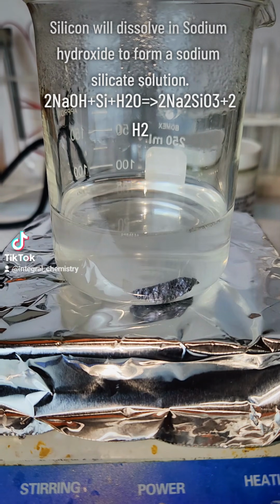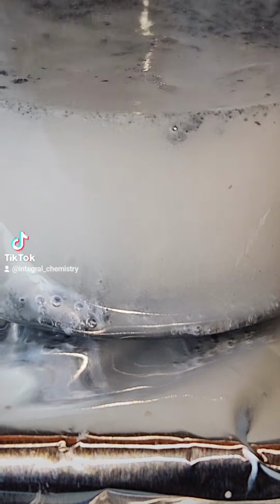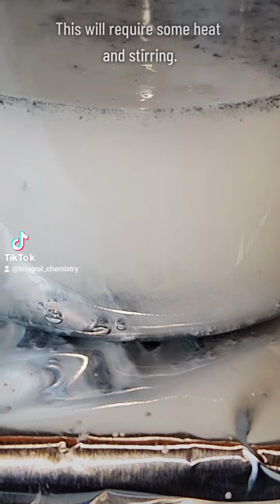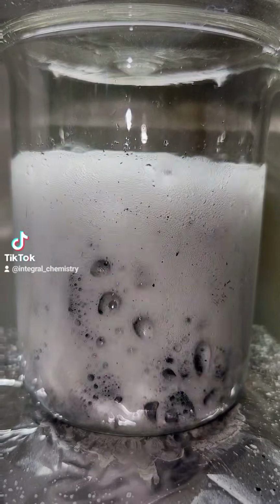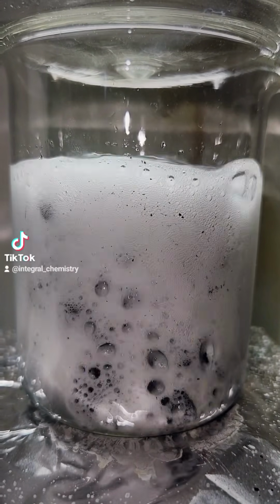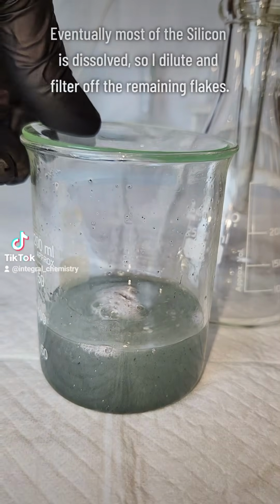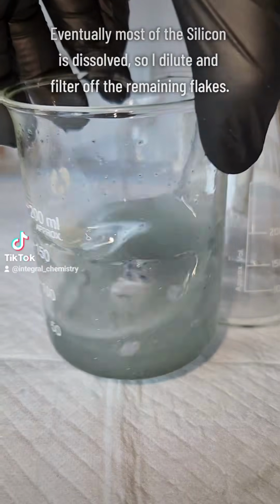And today I'm going to make pure sand from elemental silicon, and I begin by dissolving my silicon in a strong sodium hydroxide solution. This reaction between water, silicon, and sodium hydroxide will produce a very concentrated solution of sodium silicate. Sodium silicate itself is an extremely useful chemical with a massive array of uses, and I would consider looking into some of them if you're interested.